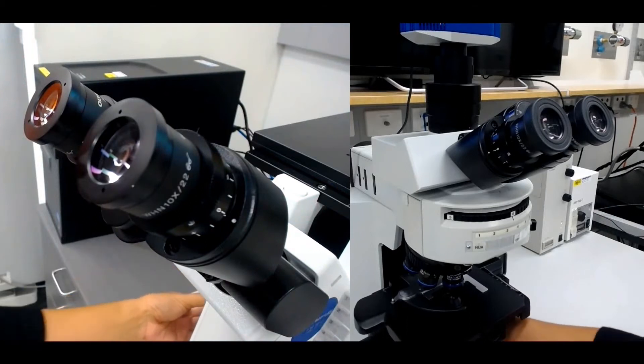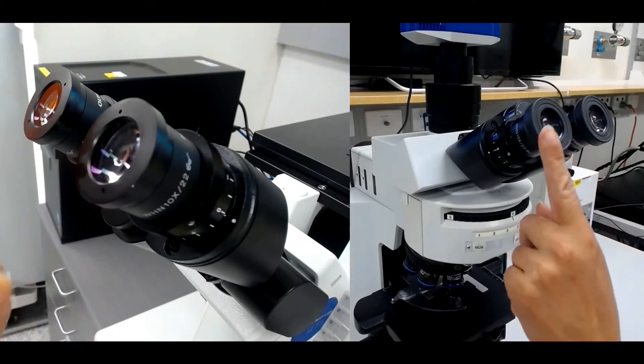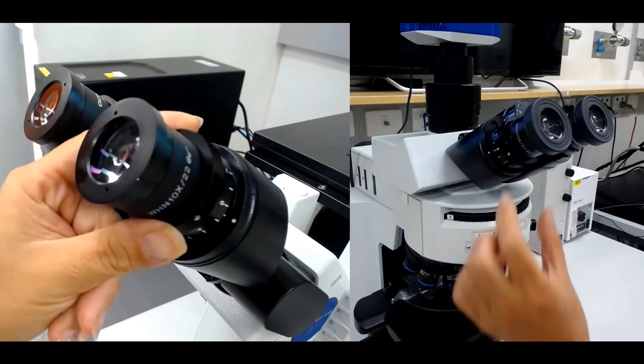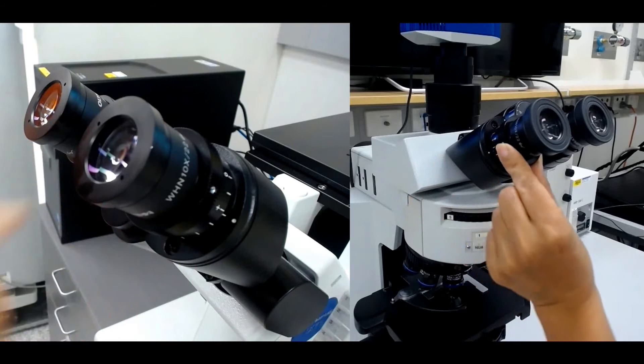Close the eye that you just used and look through the other eyepiece with your other eye. Don't touch the focus wheels but rather adjust the diopter ring on the eyepiece if the image is out of focus at all.